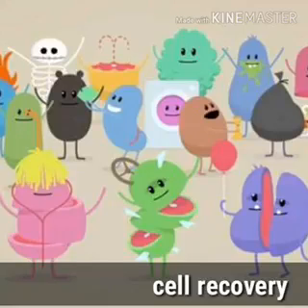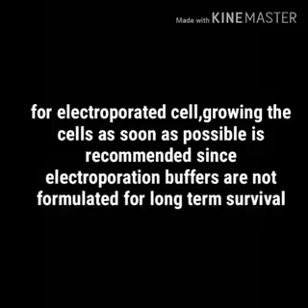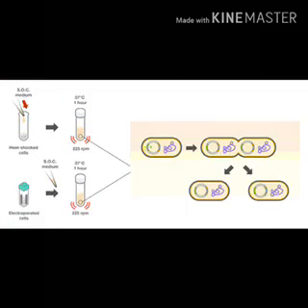The third step is the cell recovery. This step improves cell viability and cloning efficiency. For electroporated cells, growing the cells as soon as possible is recommended, since electroporation buffers are not formulated for long-term cell survival. In the recovery step, transformed cells are cultured in 1 ml of pre-warmed SOC medium at 37 Celsius with shaking at 225 rpm for 1 hour.